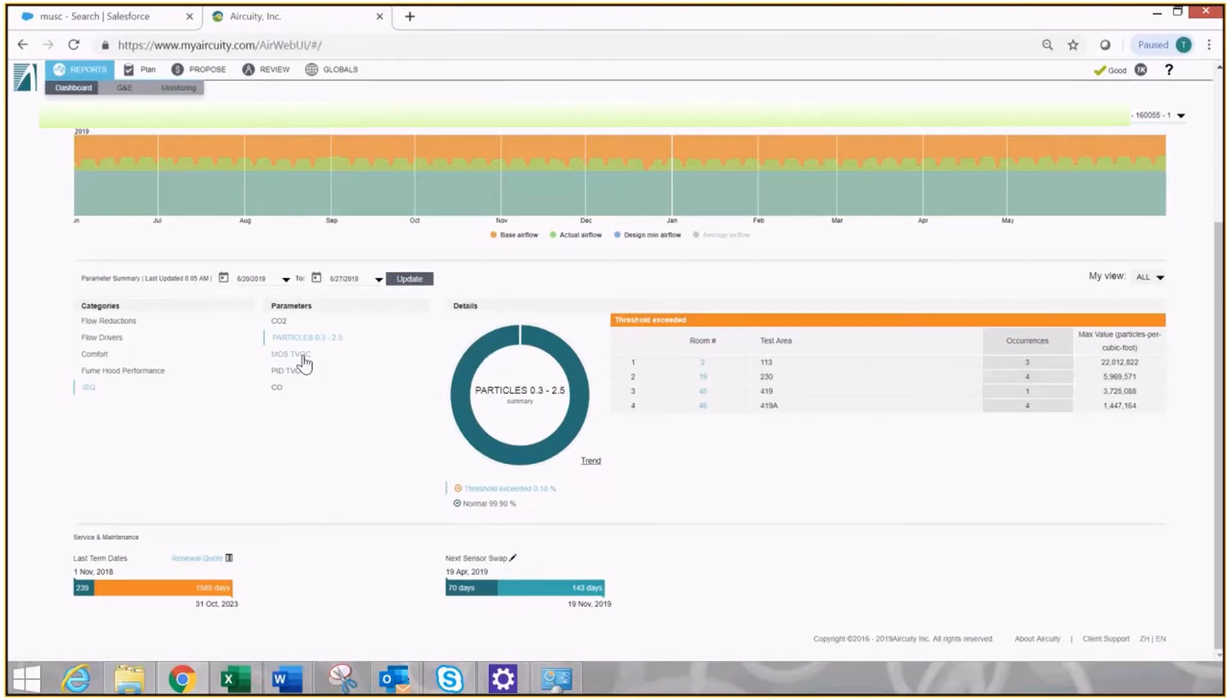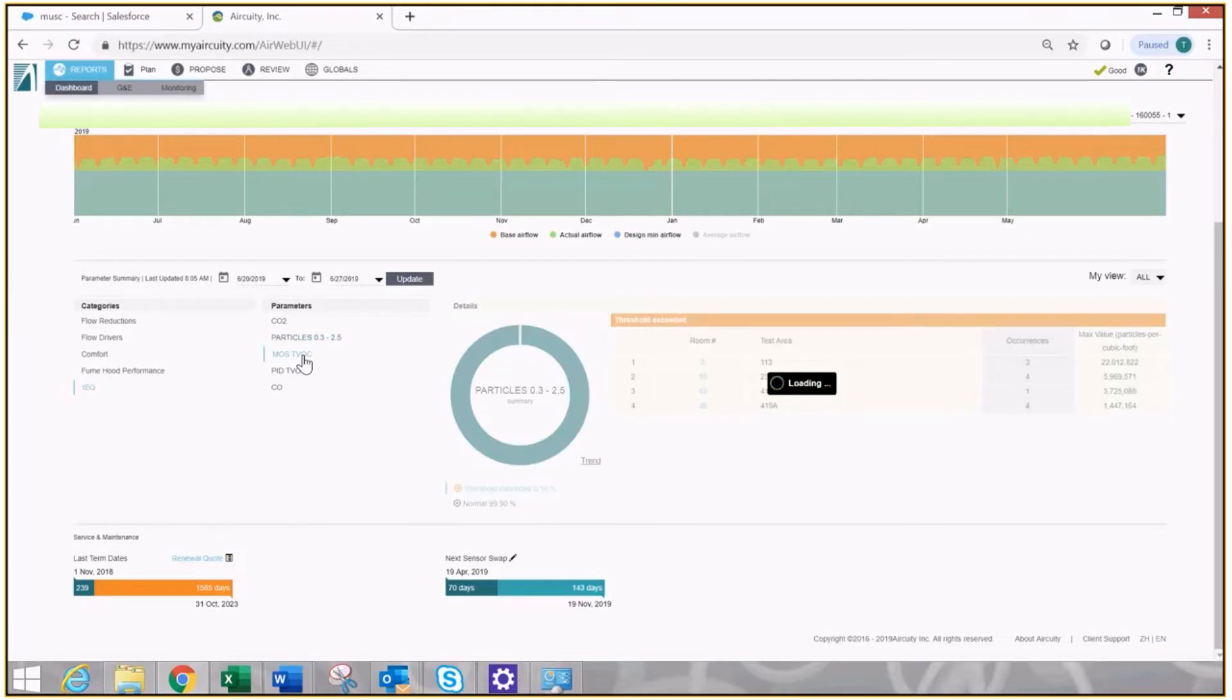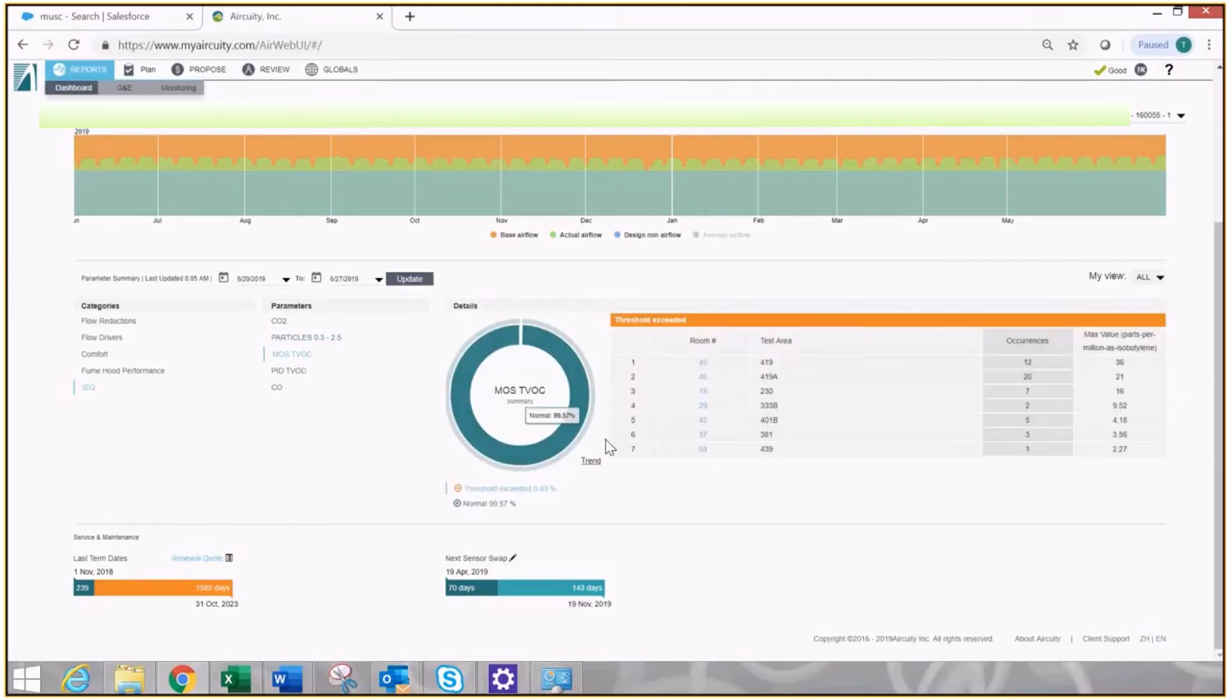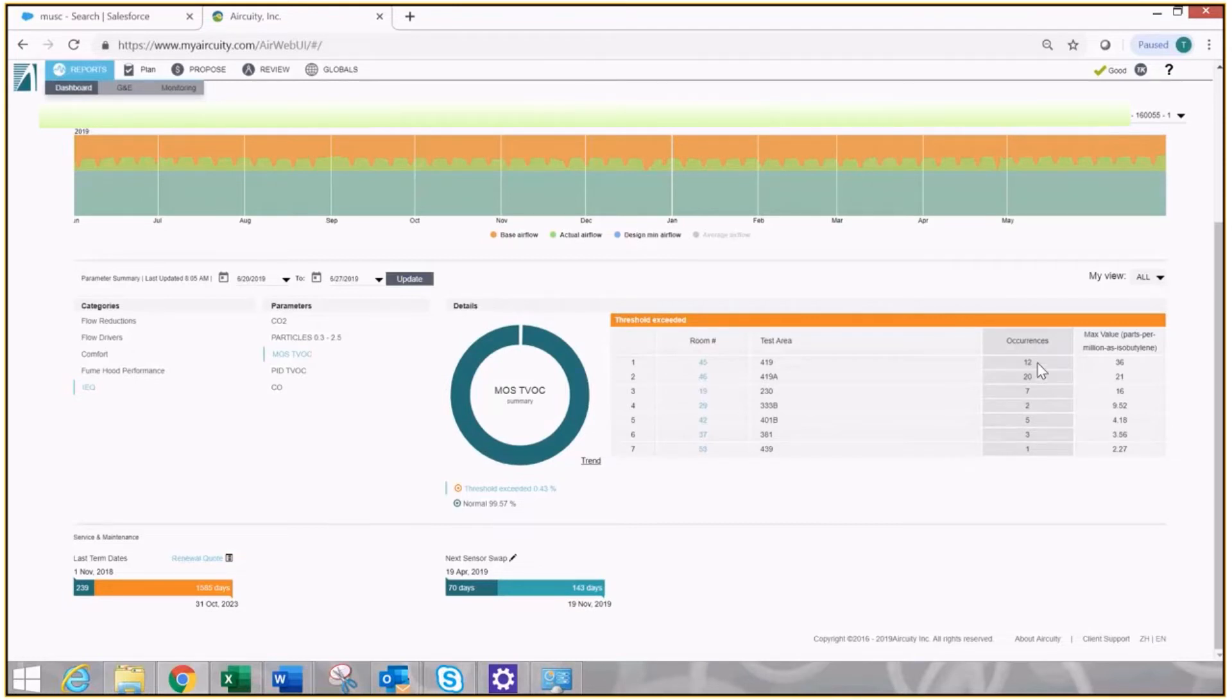I'm going to click on my total VOCs as measured by a metal oxide sensor. I'm going to see that there's seven rooms that have exceeded. Out of all of them, these two I'm worried about. 20 occurrences and 12 occurrences over a week is a lot. Room 419A has the most.